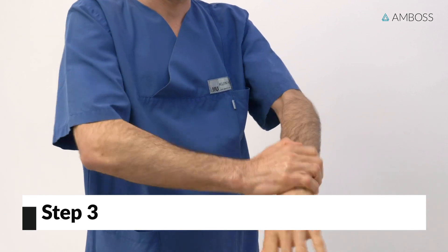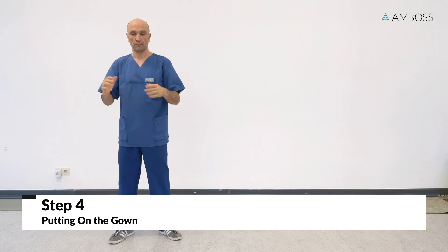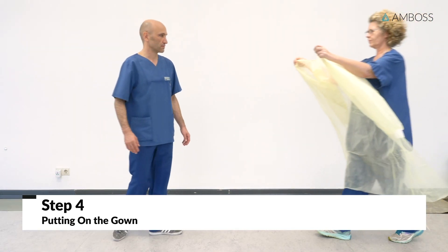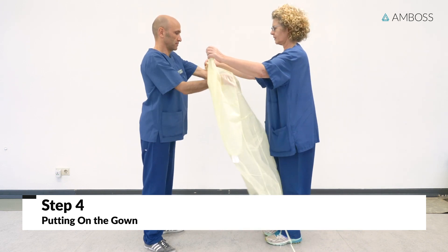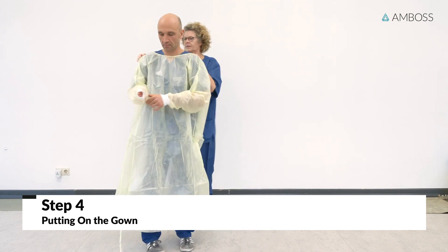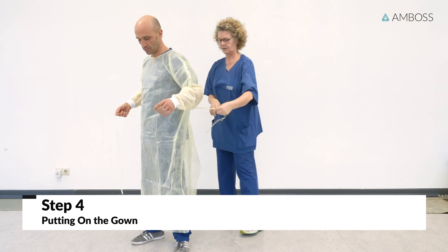Now proceed to putting on the protective gown. This step can be done on your own or with the help of an assistant. First, put on the gown — the closed side of the gown faces the patient. The next step is to close the neck band. If a gown with an inner band is used, it should remain open. The waist-level closure should be fastened at either side.